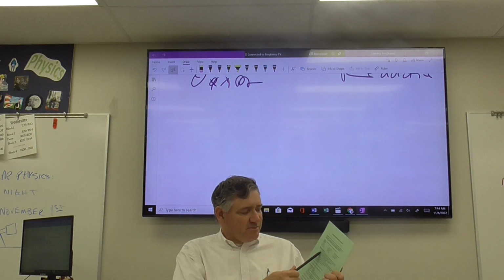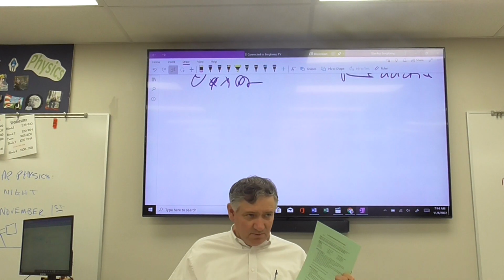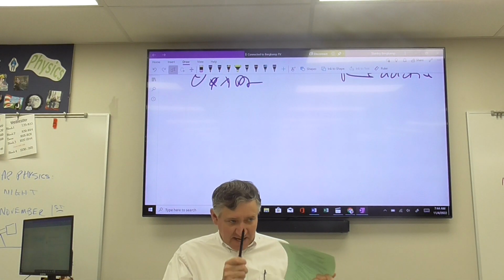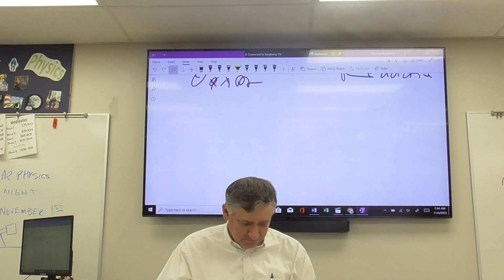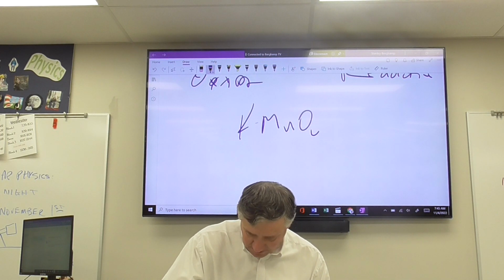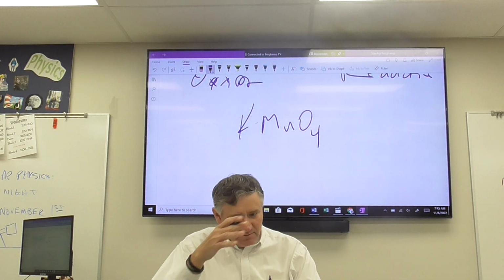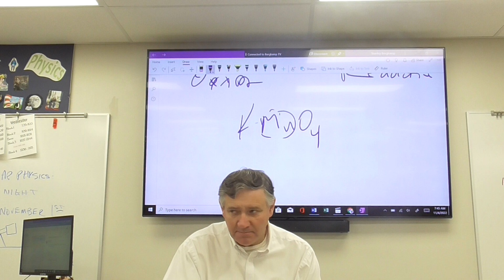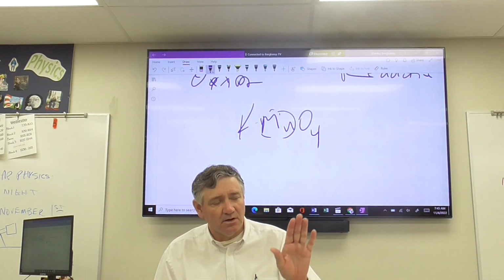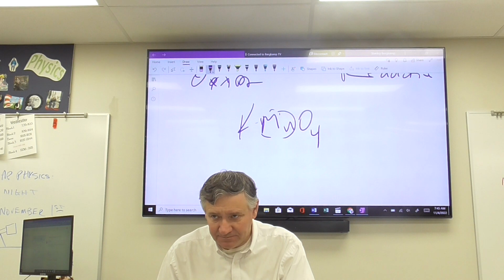So on this first one, notice I tell you to measure out 0.10 grams of potassium permanganate. Potassium permanganate has the formula KMnO4. Here's how you know the oxidation state of manganese right now. So how many valence electrons does oxygen always have?